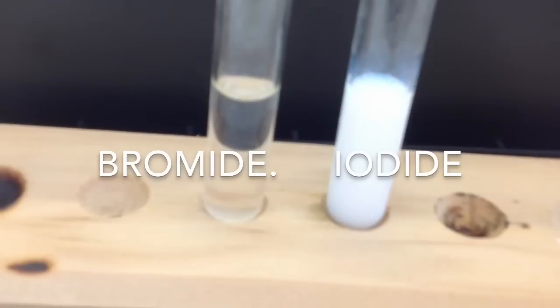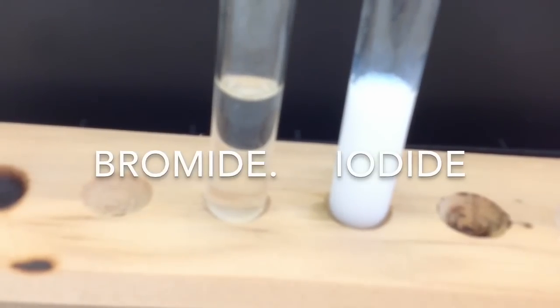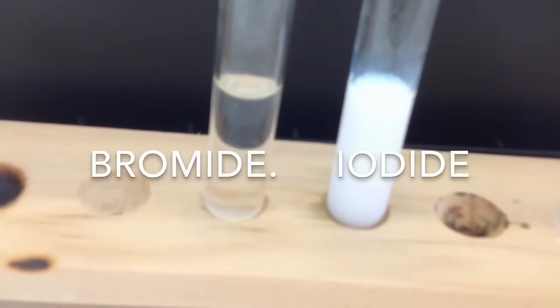Okay, and you can see that the bromide precipitate has dissolved, whereas the iodide has not.